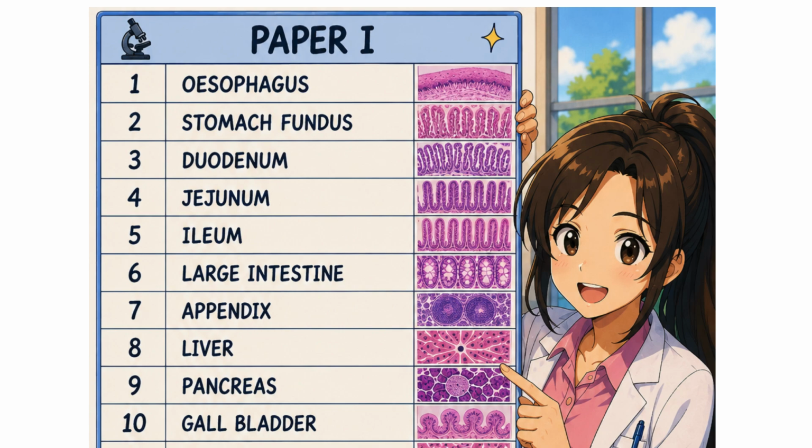Coming to esophagus, it is lined by stratified squamous non-keratinized epithelium, which is the key feature, and you have mucous gland in submucosa. And you have thick muscularis which is differentiated in upper, middle and lower third, which is skeletal to smooth transition depending on the level.